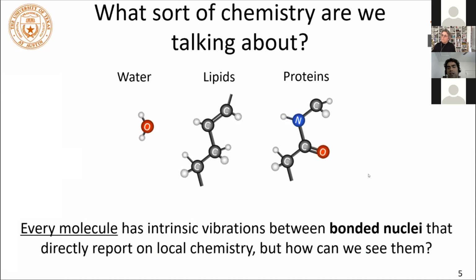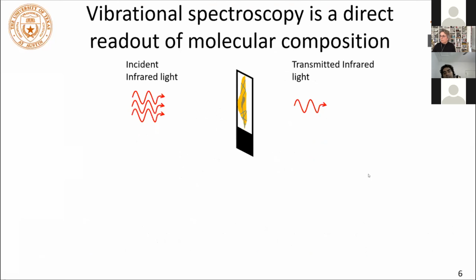And so the question is, how do you probe that? Probably many people in this talk know that you can probe electronic molecular modes, things that are electronic in nature, with fluorescence. That's how we do fluorescence: we're probing a so-called electronic state. We're not probing these vibrations. We're probing electronic states.